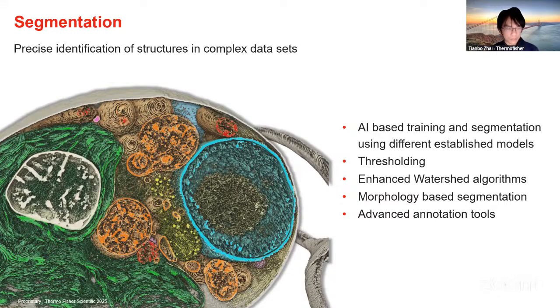But to go down to the core of segmentation, we're trying to classify the imaging data that we received pixel by pixel or voxel by voxel.